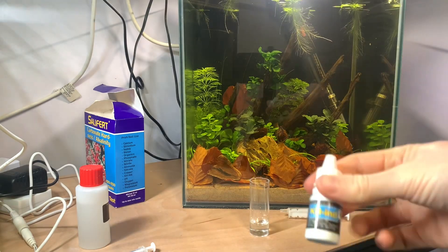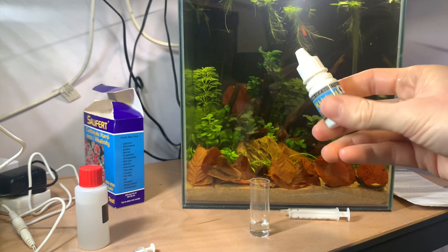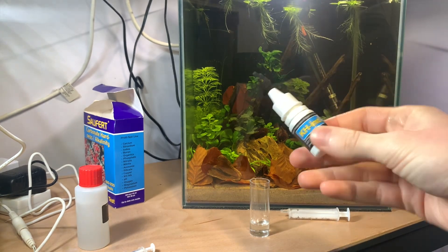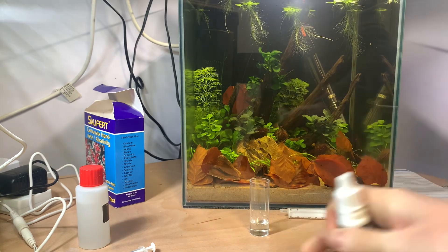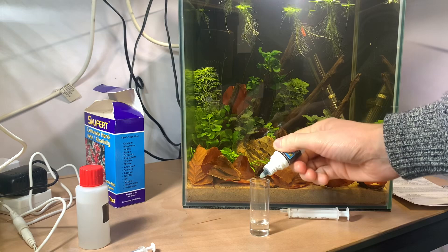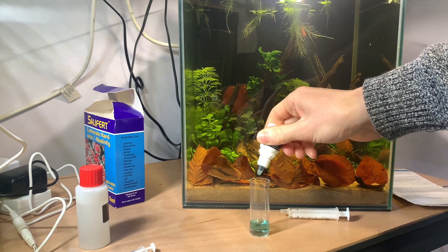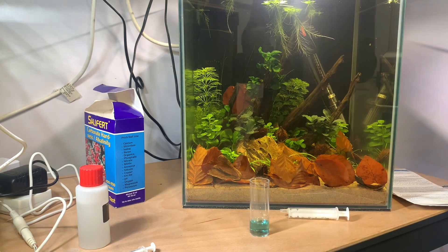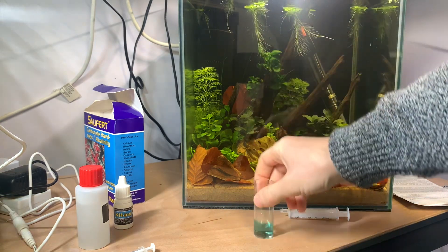We then have the KH indicator bottle. It's an indicator that's going to change colour when there is an acid present. In the vial I've got a set amount of carbonates which should be buffering the water. I'm going to add one, two, three, and four drops into that solution. That's going to turn a nice blue colour — give it a quick swirl to make sure it's all evenly distributed.